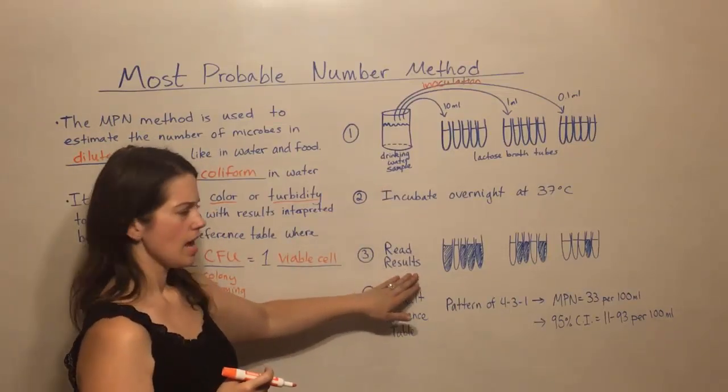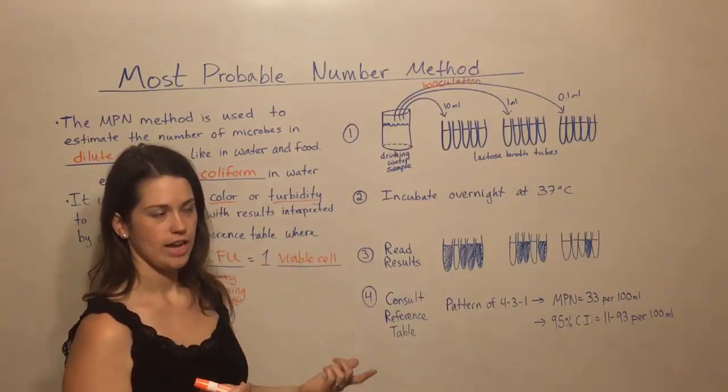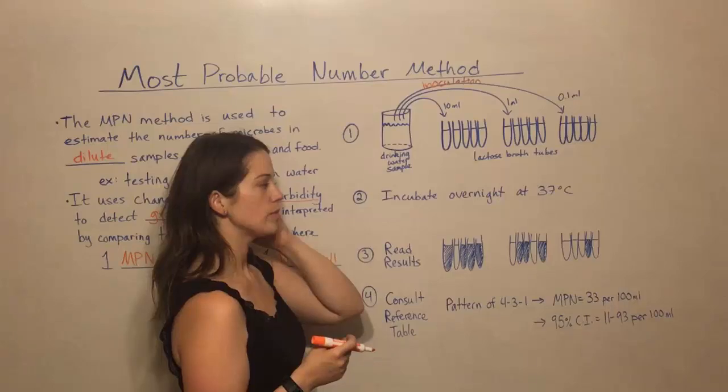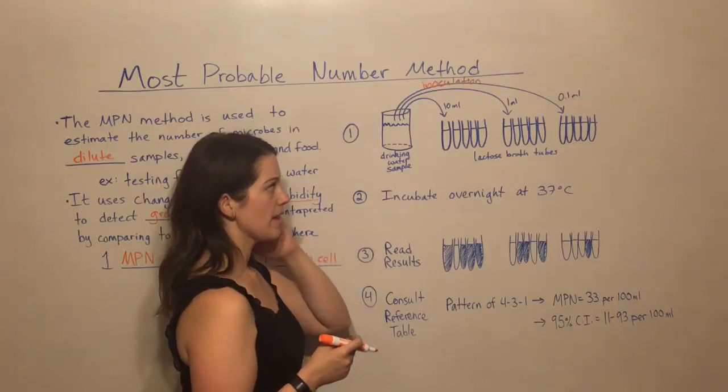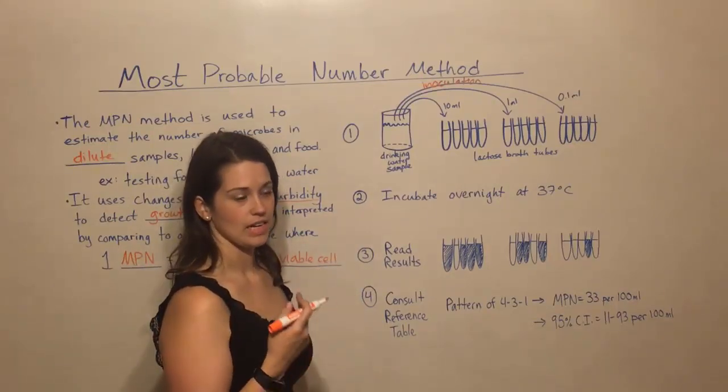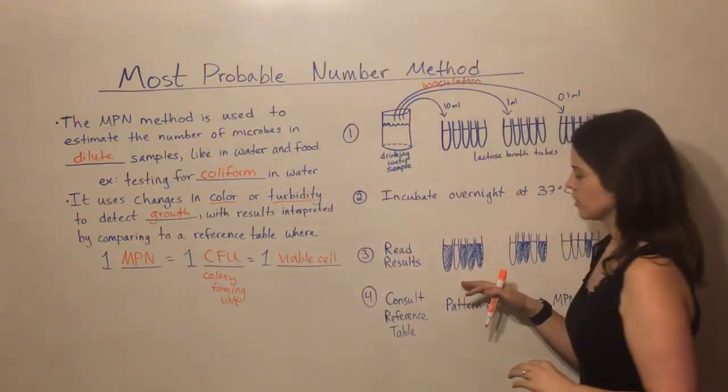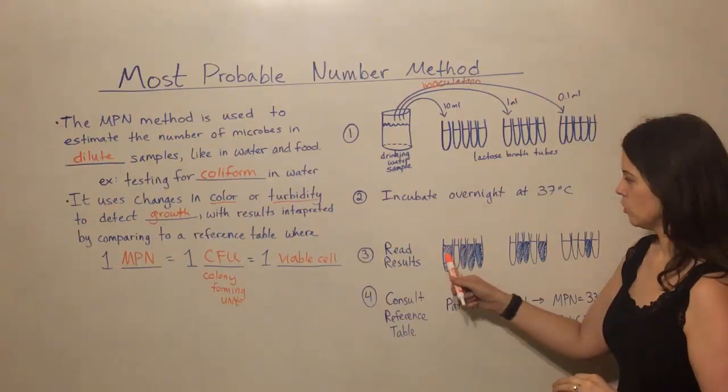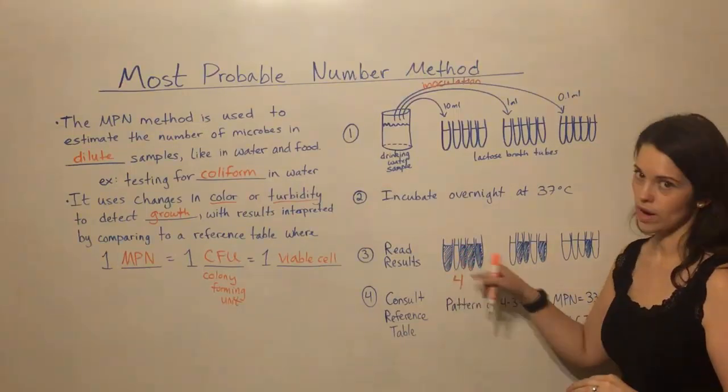Then it's time to read results. And what that means is you're looking for the color change. So when coliform bacteria are present in these broth tubes, they will ferment the lactose and that results in a color change. For this particular test, we have four positive tubes here. So four of them showed a color change. One did not.